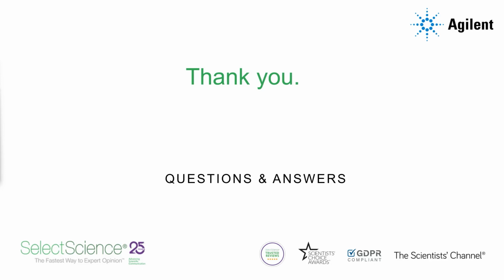The first question I have for you guys is, what are the advantages of analyzing cells in droplets? Hello, I think I can answer that. It's Bárbara here. The main advantage of analyzing cells in droplets is that the full cell secretome, or whatever the cell secretes, can stay contained.